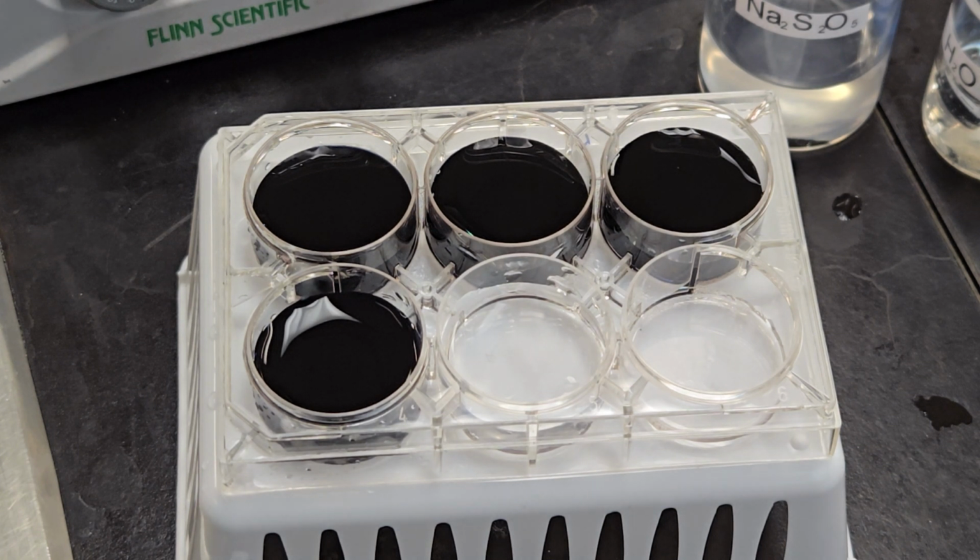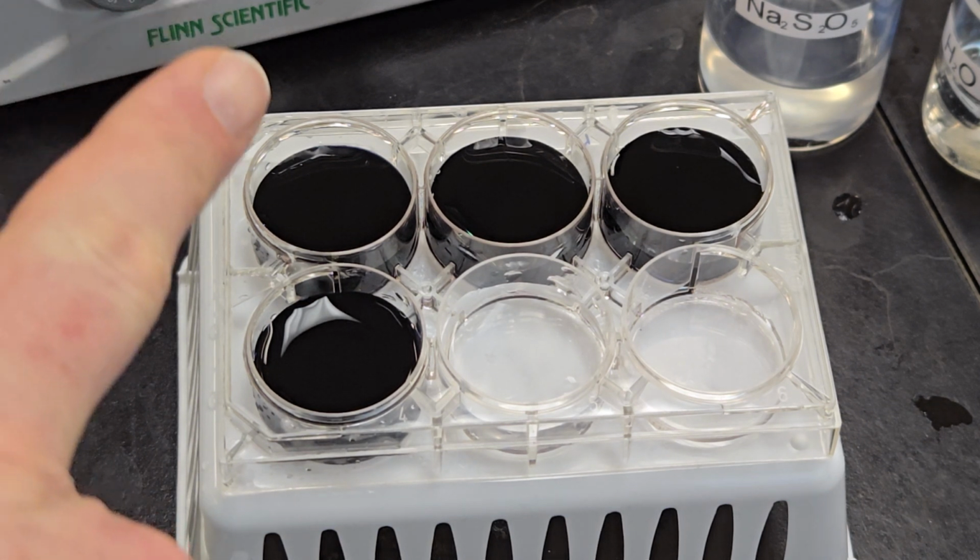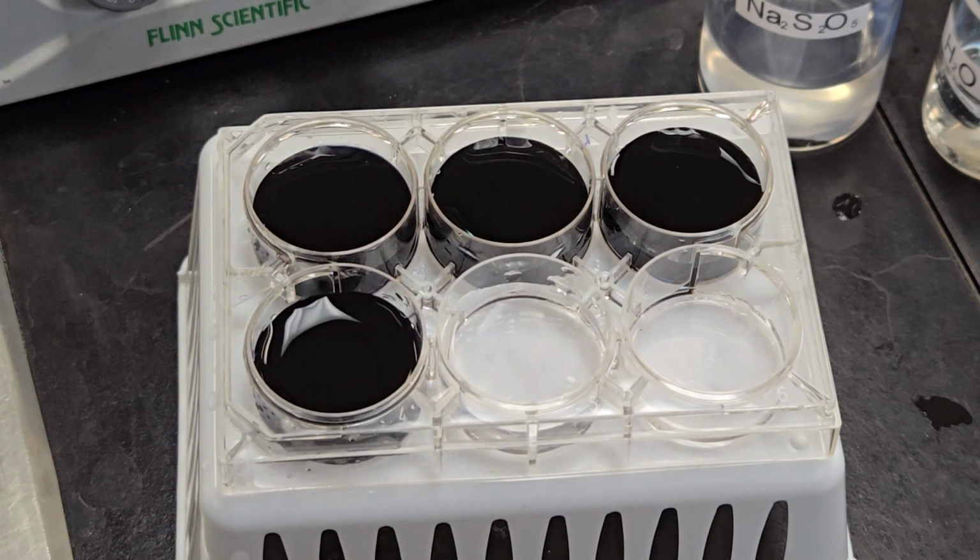If you find that one of your later times is actually faster than one of your earlier times, something has been recorded wrong, you might want to go back and look at the video, because every reaction should take sequentially more time throughout. Fastest to slowest. Fastest up here, slowest on the bottom. As you can see, this one's already taking a significantly longer time.